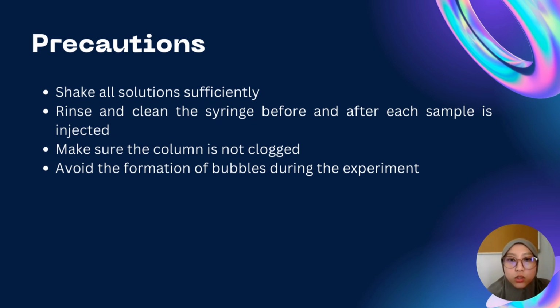First of all, do not inject the solution into the chromatograph until you have shaken it thoroughly for at least 5 minutes. The solution must be fully dissolved to achieve accurate and reliable results. Besides that, rinse and clean the syringe before and after each sample is injected to prevent any contaminants and other solutions that might jeopardize its efficacy.